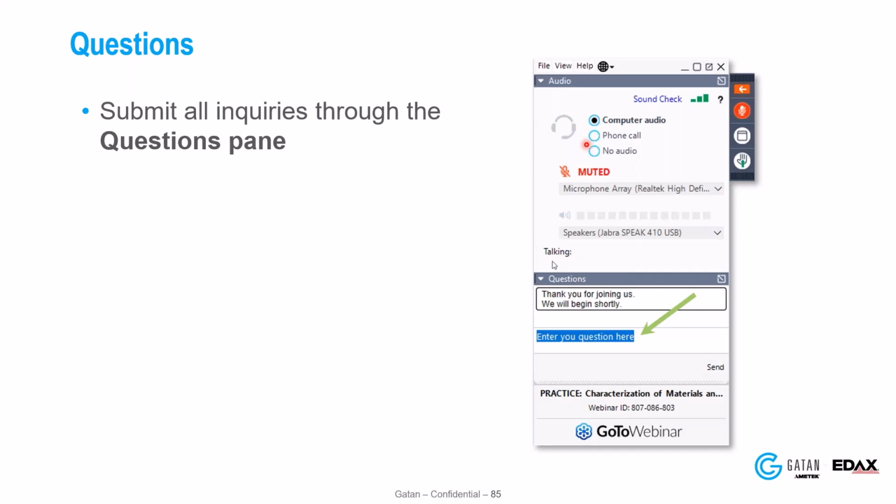And then there's a question, is it possible to do spherical indexing for old OIM files? It depends on which file. When you save a project in OIM Analysis, generally I don't use those to do it. I generally like to use the older OSC files with the pattern files. That's what I'd export. In all honesty, I haven't tried with an OIM file. It should have all the data, and you can link a pattern file to a specific data set, so it should probably work, but I haven't tried it. But generally, if you have the initial data from the software, you'd have it.